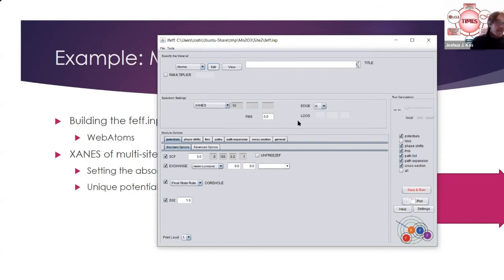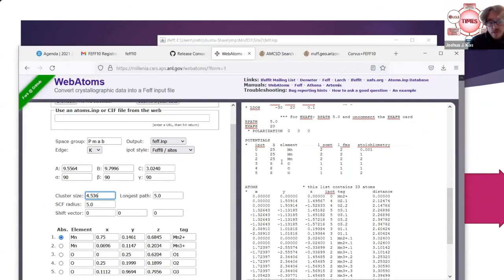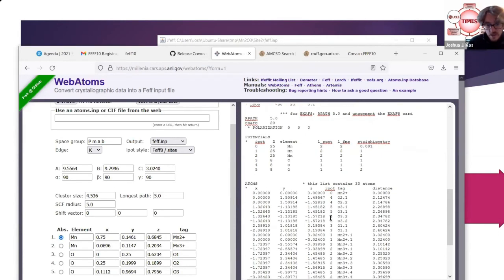But once you're done with that, then you have 2 different X-ray absorption spectra, one from each site, and you'll have to use something different to average those. And you have to average them with the correct stoichiometry that comes from their site symmetry. And in particular, the second manganese site, which is the Mn3+, is twice as prevalent as the first one.